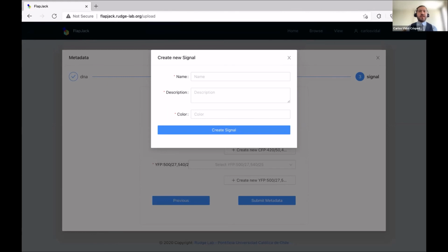And I think that goes directly with the question: on a related note, can you do bulk uploads too? I think that it's easier to do using the API. Yeah, so at the moment through the front end, there's no bulk upload. The difficulty with bulk upload is that each assay, so for example, I might have 10 assays that I want to upload in bulk, but you'd have to describe the metadata for each assay individually, so it's a bit tricky.